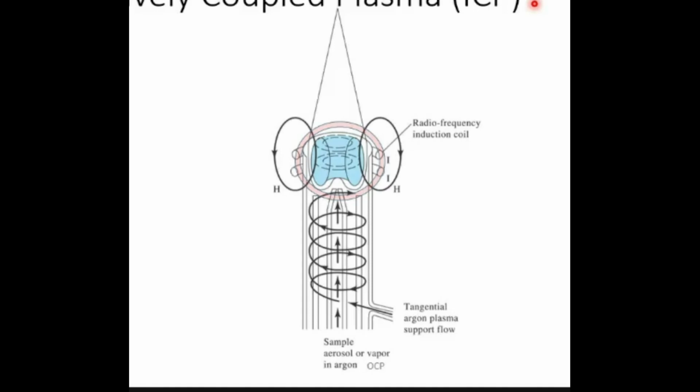So in the area which is highlighted in that pink circle, all these commotions are occurring, and as a result of the collisions, of the ionization, and because of the induced force, the temperature goes very high. This is called ohmic heating. Ohm is related to resistance. So there is resistance also, and the overall temperature in this region goes very high.